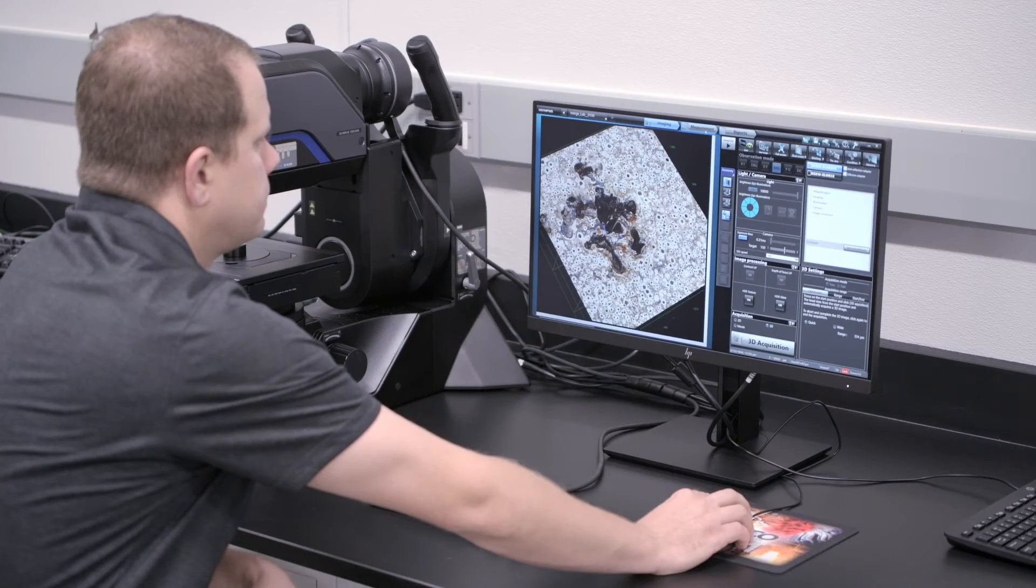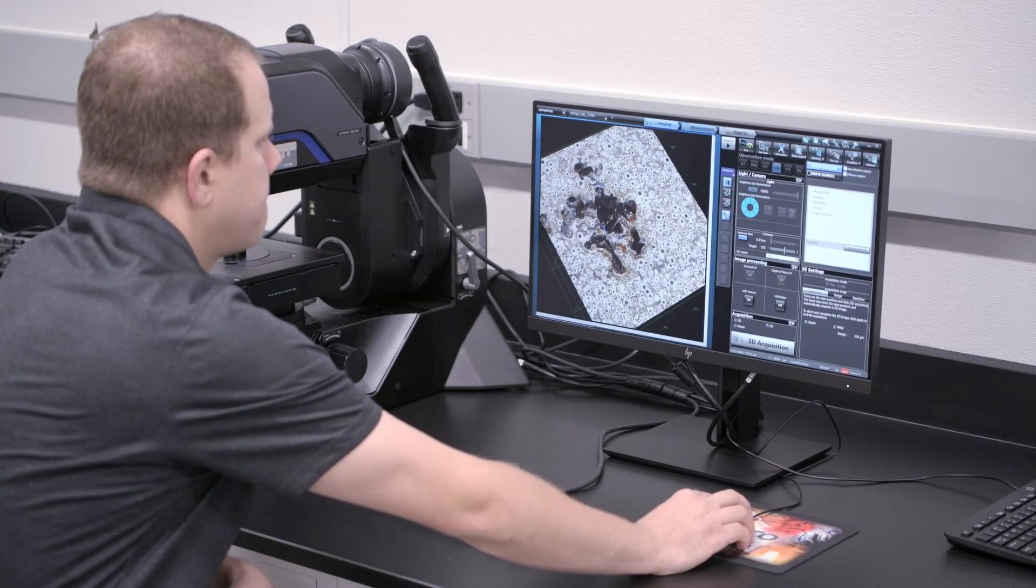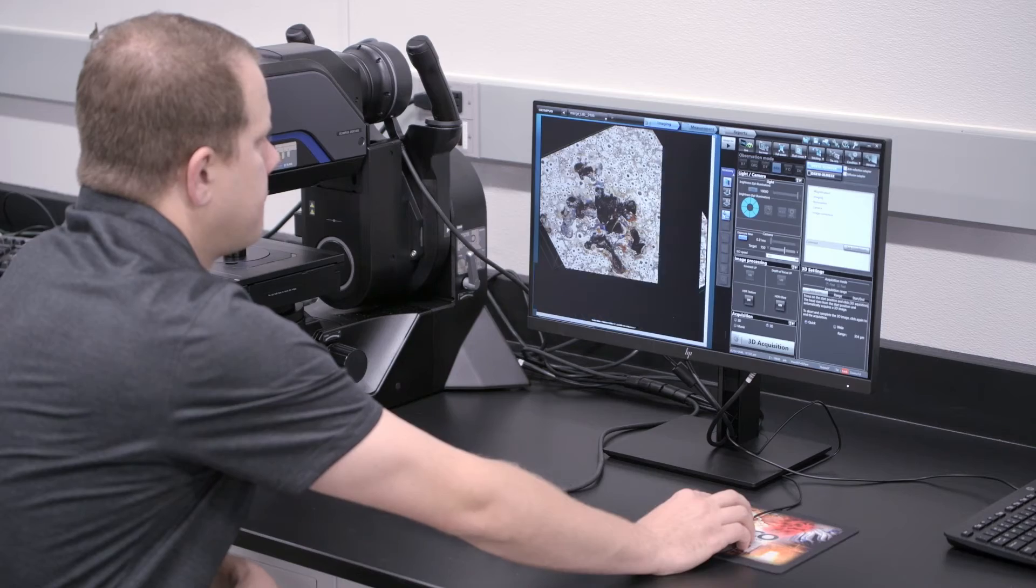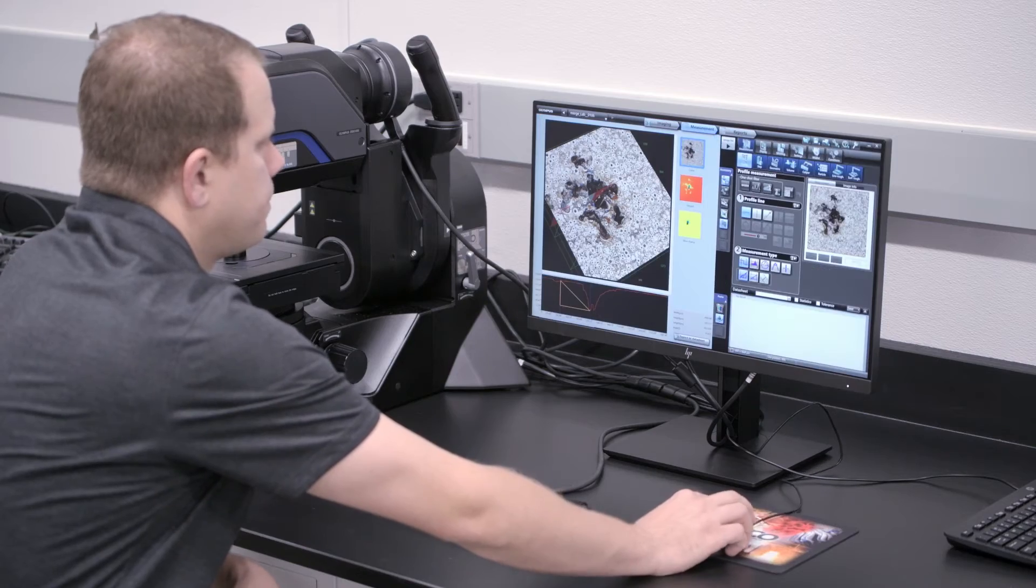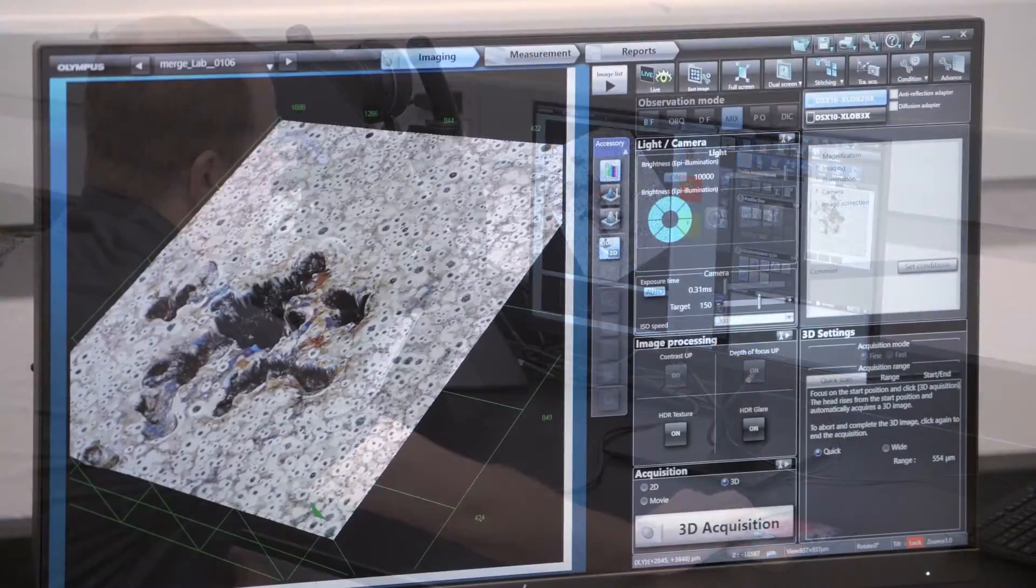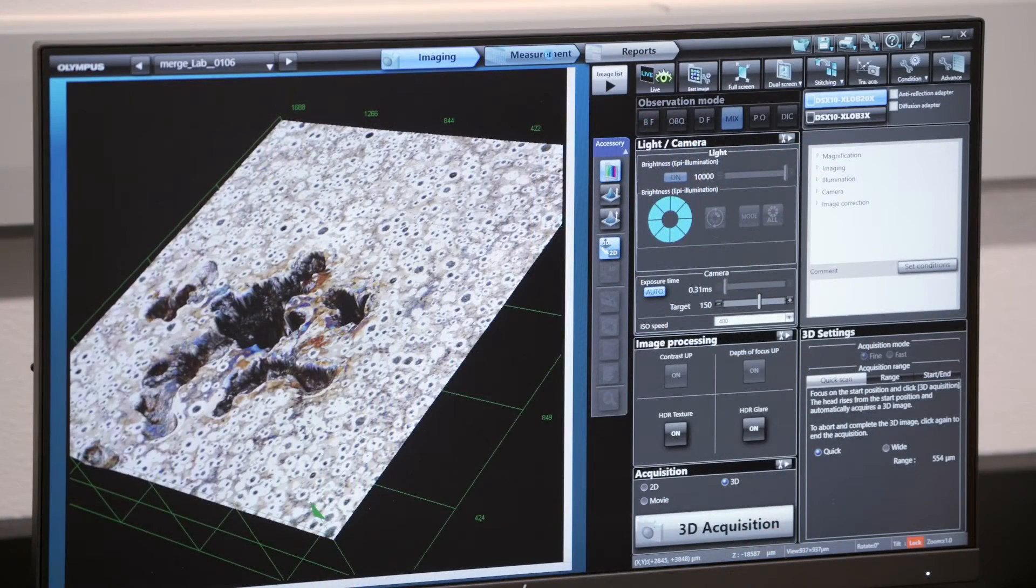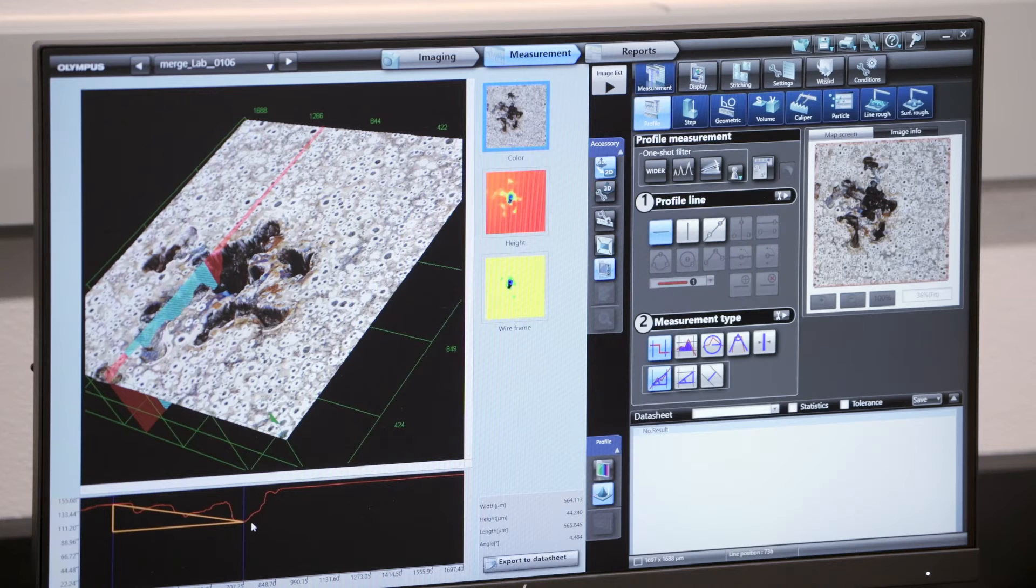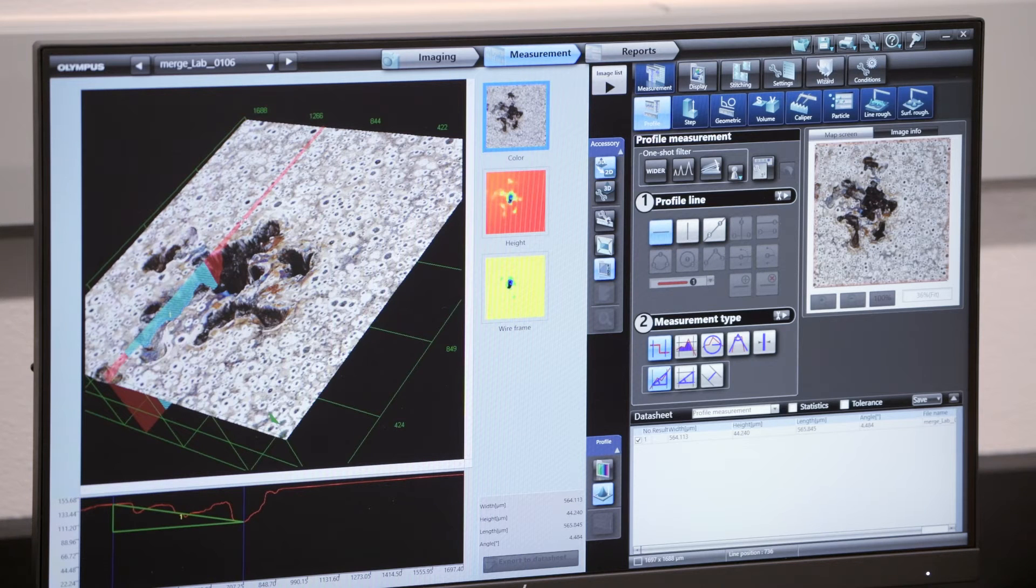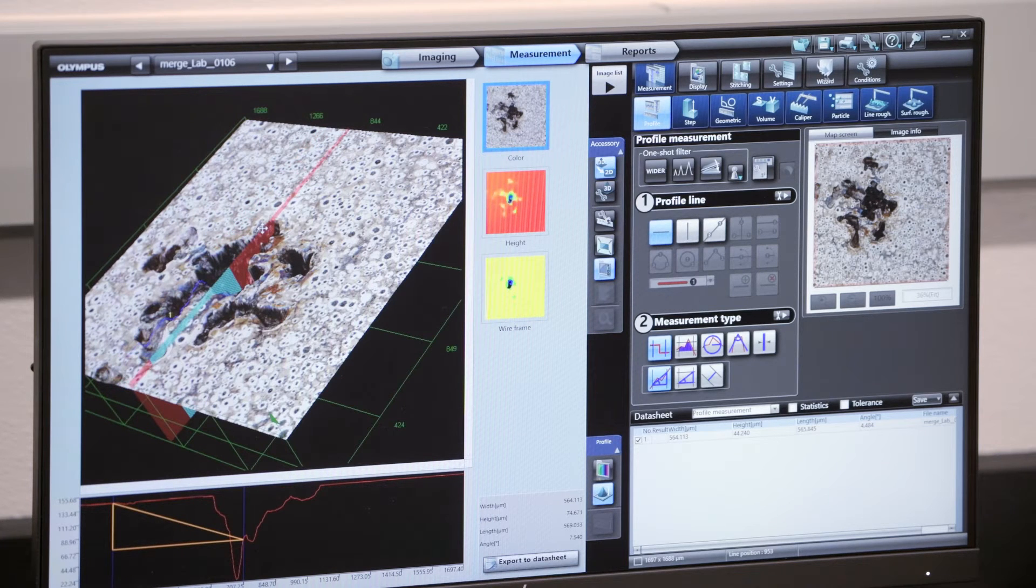With 2D and 3D measurement capabilities, including step height, volume, and surface roughness all in a user-friendly interface, many measurements are achievable and reportable directly in the software.